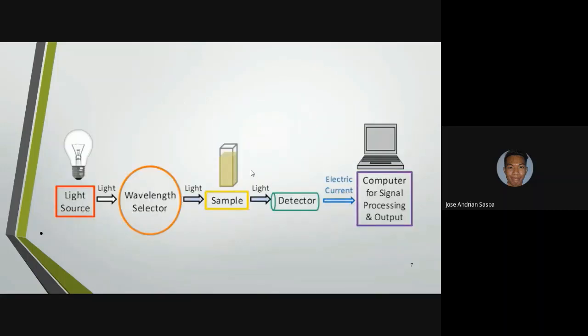So we have here an illustration or picture showing the parts of the UV-vis spectroscopy. We have here the light source.